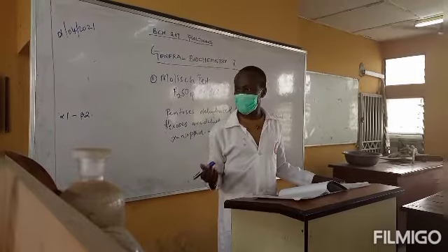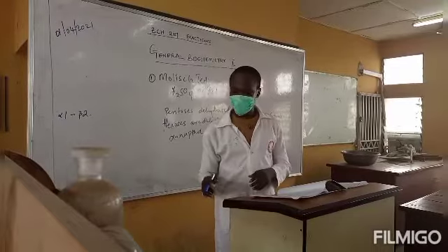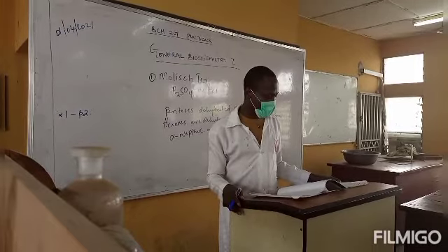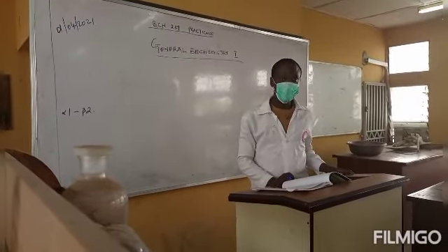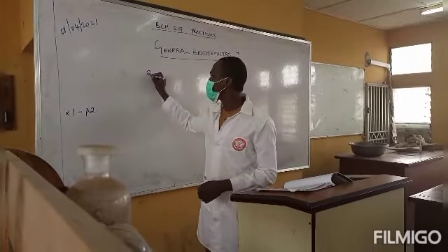All these carbohydrates will be provided, and we are going to carry out the Molisch test on each of the carbohydrates. So that's all about the Molisch test. The second test we are going to carry out is the Benedict test.